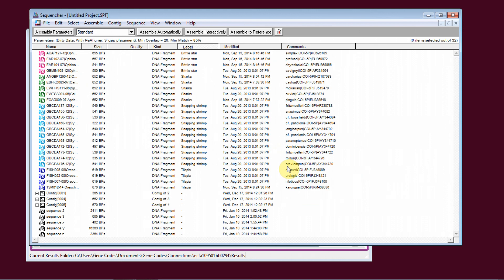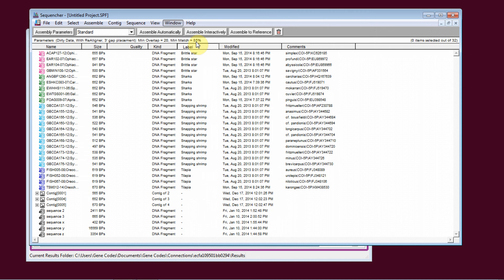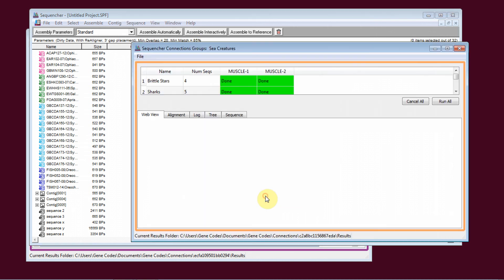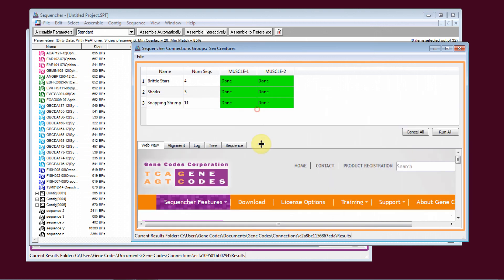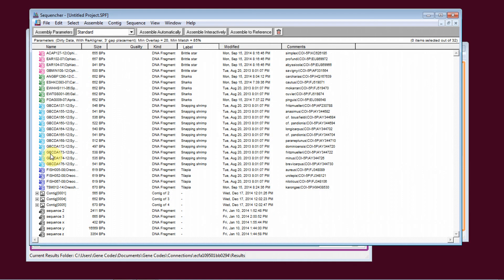Sequenture Connections is now more flexible and customizable in Sequenture 5.3. You can now open Existing Connection Sessions and add sequences to existing sessions.